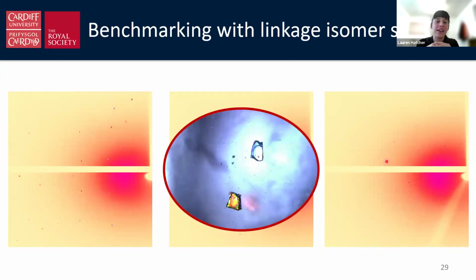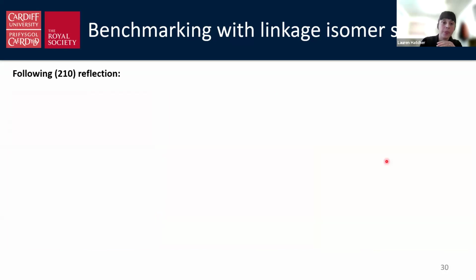And what we can see here, so we look at a crystal that hasn't been irradiated and a crystal that has, we've got some crystal damage. And it turns out this is actually not the result of X-ray exposure. This is totally the result of light exposure with the LEDs. Even though these LEDs aren't fantastically bright, this system does get photo bleach with extended light exposure. Okay, so this is a problem that we need to think about overcoming.